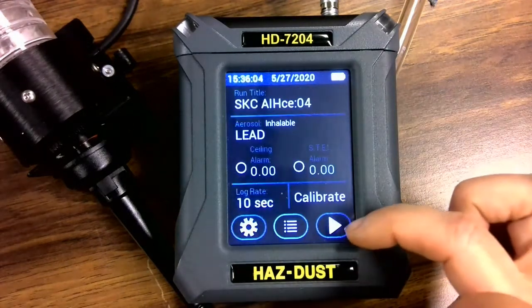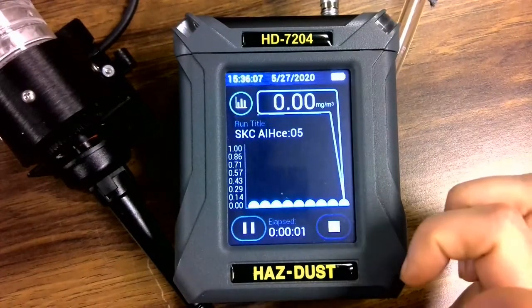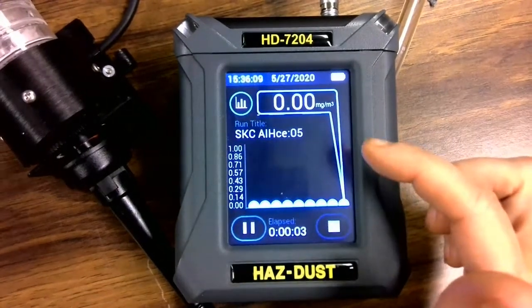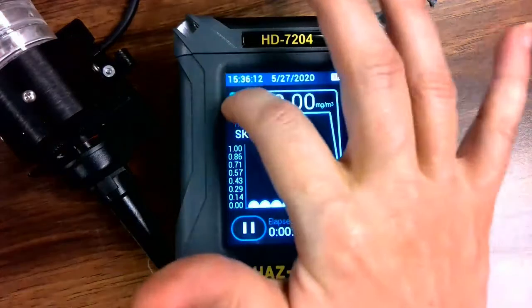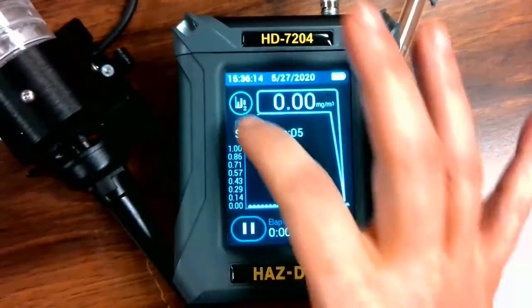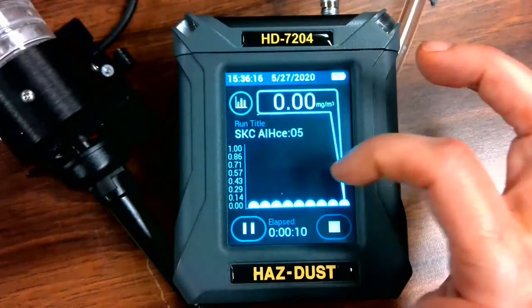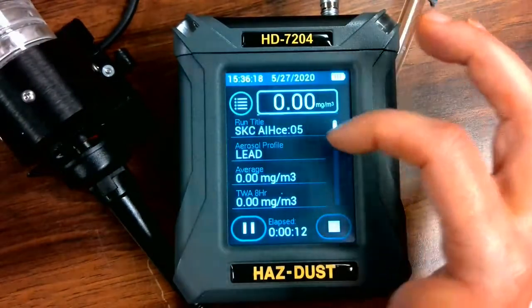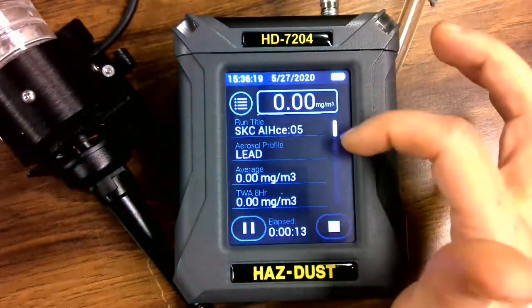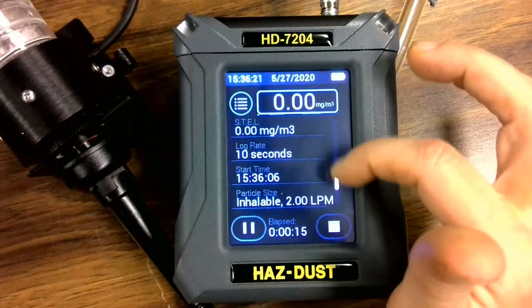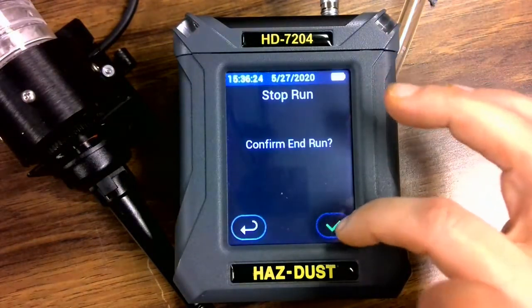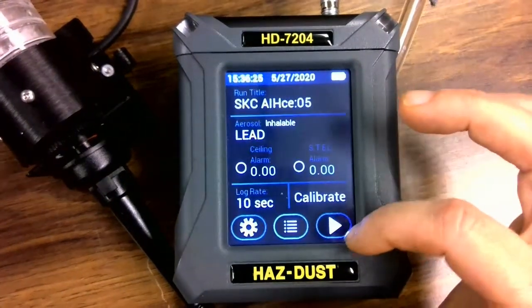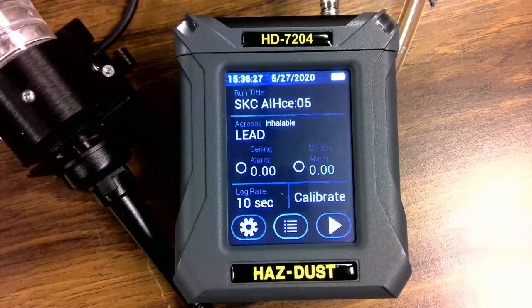Lastly, we have the play button. Select play and we have our real-time graph. Here we can select a five-second or one-second sample, and on the last screen we will have your on-screen statistics. Stay tuned for more videos on the HD7204.